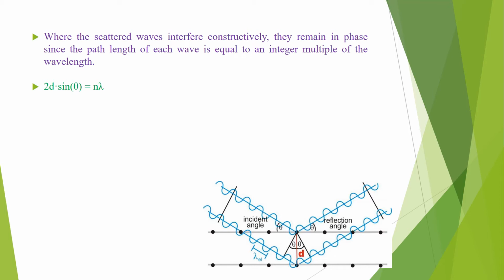Here is the pictorial elucidation of Bragg's equation, in which two different waves are coming and striking different planes.